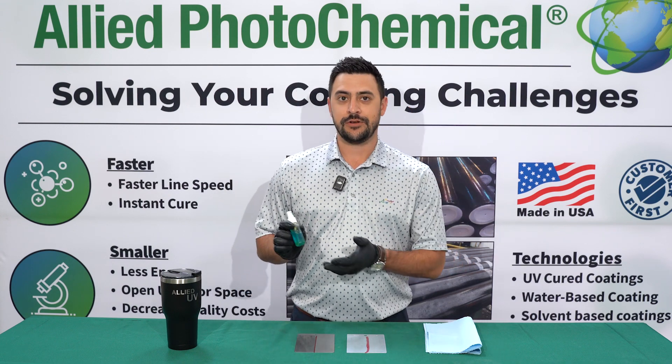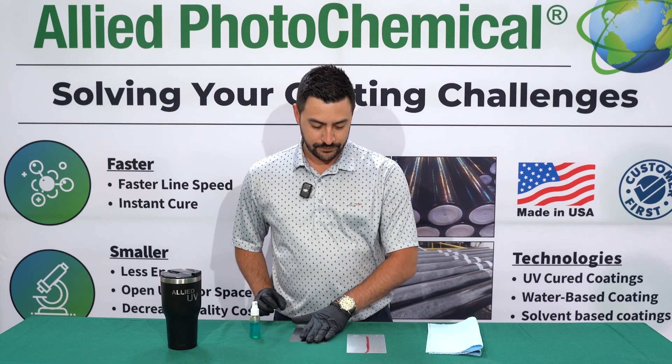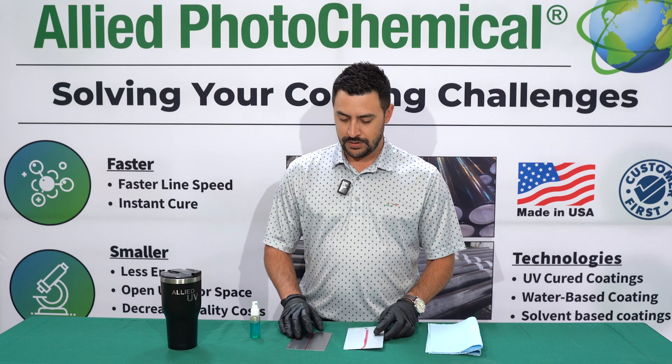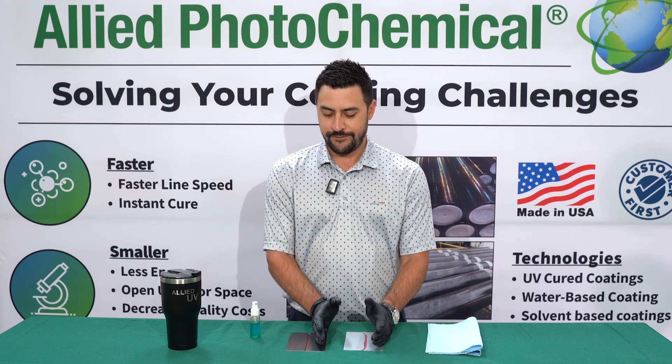What I have right here is copper sulfate. This test is very simple. We've taken a regular metal panel and a galvanized panel. The right half of each panel is coated, and the other half is bare.